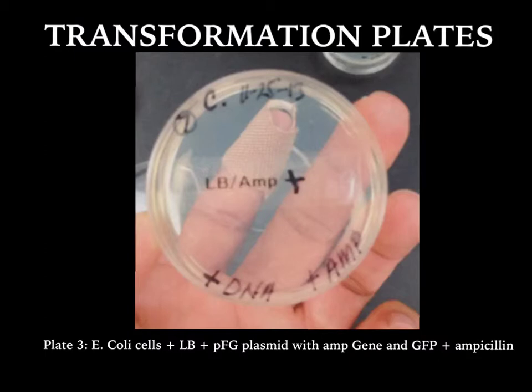The transformation plates should have been the only ones that contained genetically transformed bacteria cells. These cells were exposed to the plasmid, which contained the selective markers for transformation to occur. We expected cell growth for this plate, but only for those cells that took up the plasmid, transcribed and translated the ampicillin gene, which would allow production of proteins or enzymes that would be resistant to the antibiotic. However, they would not fluoresce because the molecule IPTG was not added. Our observations showed that we did not achieve any cell growth.